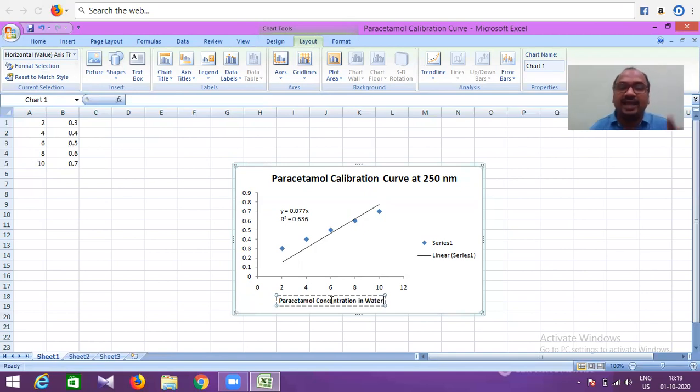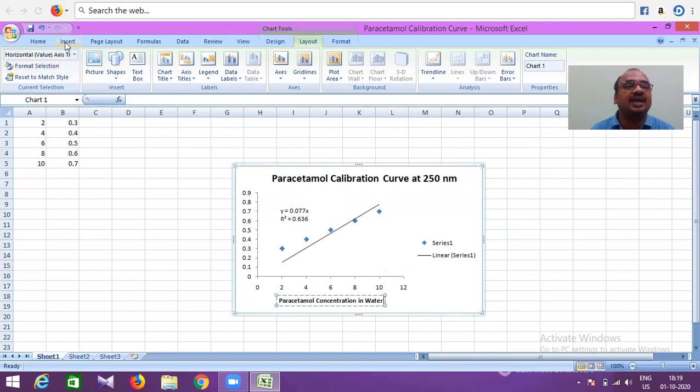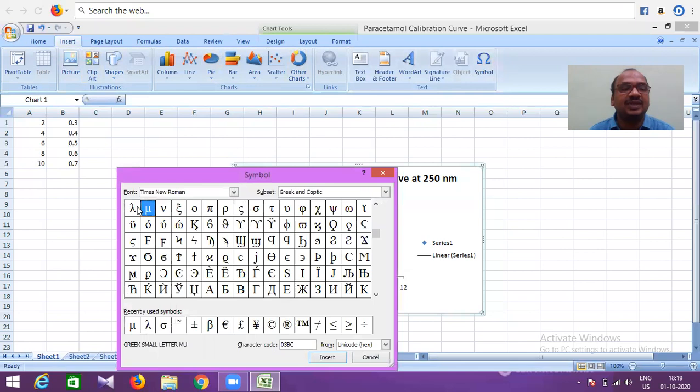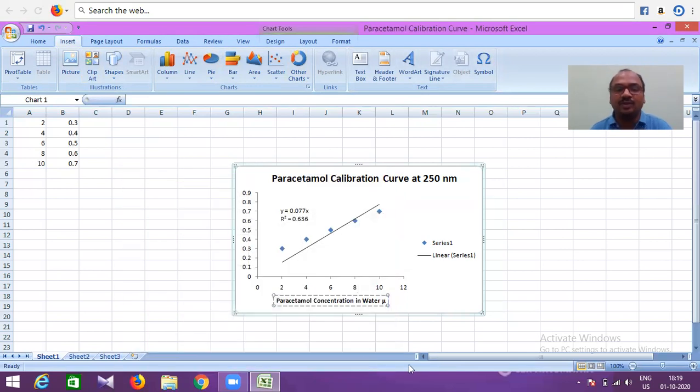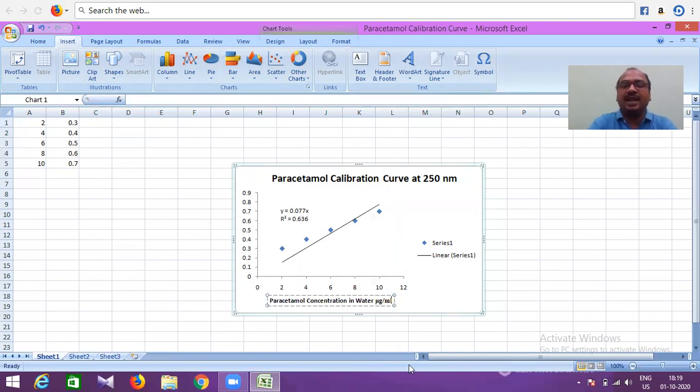Micrograms per ml. Micrograms means here you need the micro symbol. Go to Symbol, select the mu, insert, and close. So: micrograms per ml. Now it's okay.